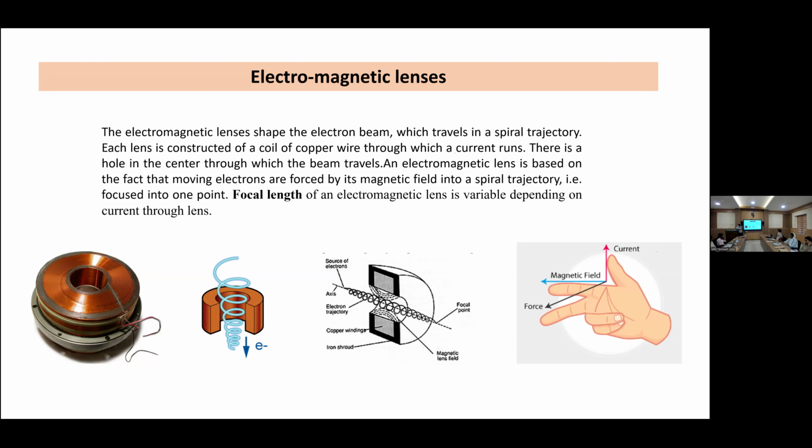Near the TEM console, you can see some console panels. There we have knobs. By adjusting the knobs, we are changing the current. That's how we are changing magnification modes, and aberration, everything, by adjusting the coils and changing the magnetic field. That's why most people say we will not analyze any magnetic samples, because if we insert some magnetic samples, they may jump to the magnetic lens. Then it can affect the lens quality.